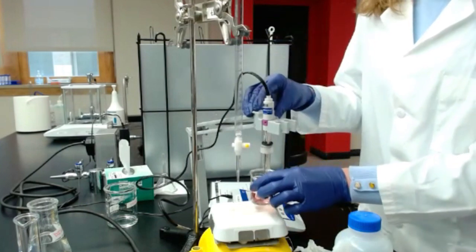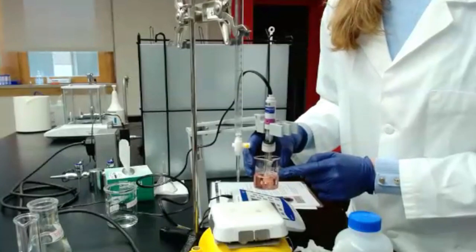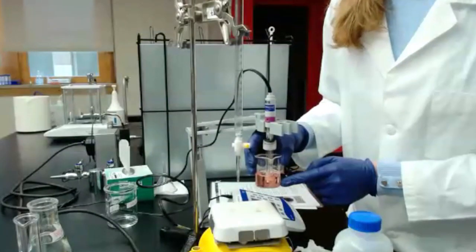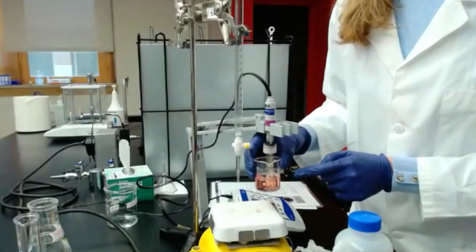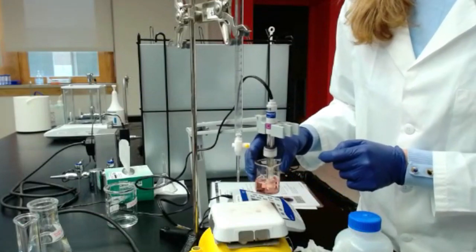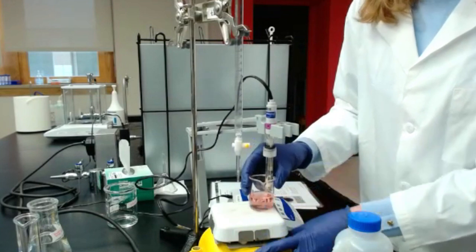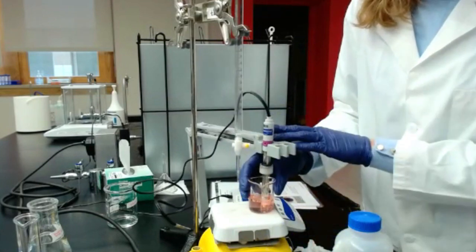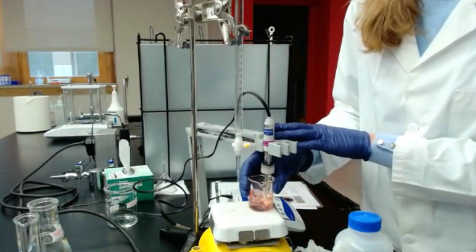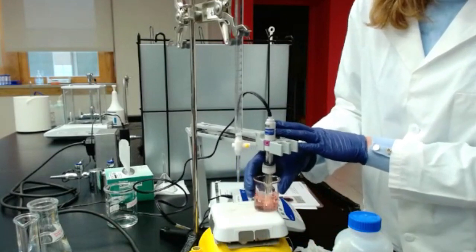To calibrate, make sure the entire probe is within the solution, and also make sure you have a stirring movement. If you don't have a stir plate and a stir bar, you can stir by hand. Make sure it's always in movement, always shaking.